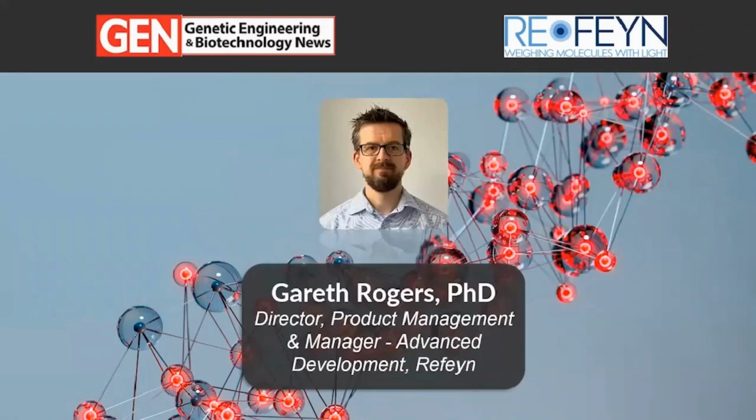In fact, let's meet our presenter for today's event, Dr. Gareth Rogers. He's Director, Product Management and Manager Advanced Development at Refeyn. The company pioneers analytical instruments that feature mass photometry. Gareth will discuss how both size-exclusion chromatography and mass photometry were used to measure aggregation levels of trastuzumab, a monoclonal antibody, and several trastuzumab biosimilars.